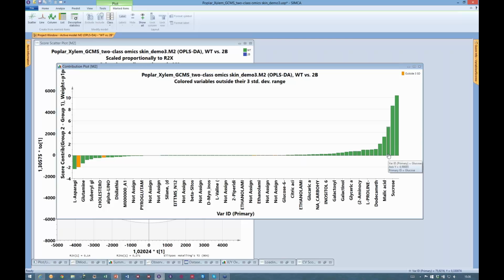And we can see that some of the samples that have the largest influence are glucose, sucrose, and fructose. They are all sugars, and for people that are initiated with the current type of experimental setup and the current type of samples, that would point to sample preparation issues.